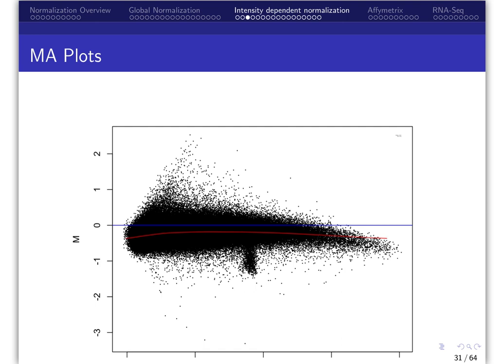Although the two samples can be different for different genes, the majority of genes should have roughly similar expression levels across both samples. Therefore, on average, the difference M should be 0, and the difference should not depend on the average expression values. Here the trend is for the difference to fall below the y equals 0 line, and therefore intensity-dependent normalization would likely help.